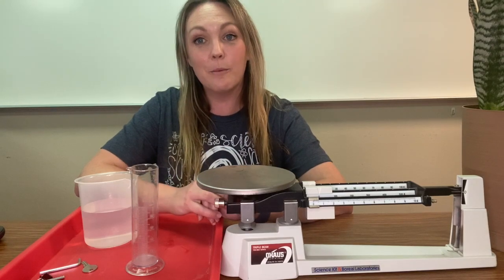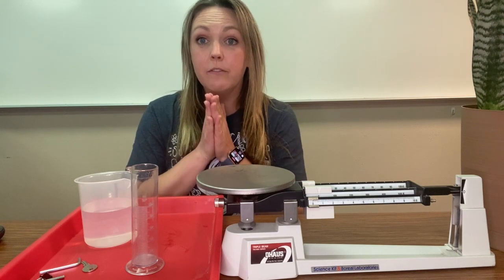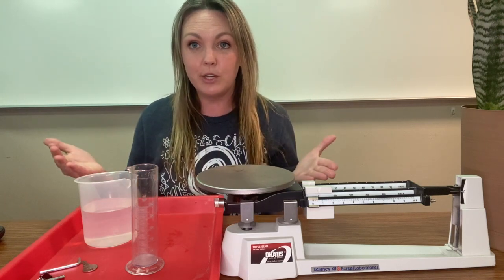Hello, this is Mrs. Hink, and let's talk mass. Mass is the measure of the amount of matter inside of an object.